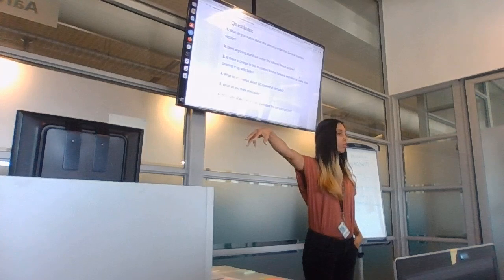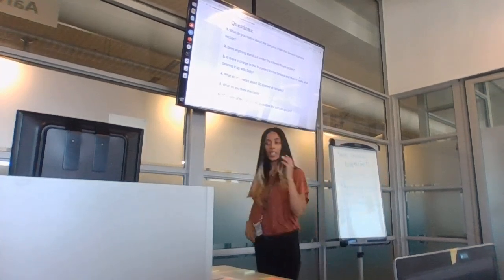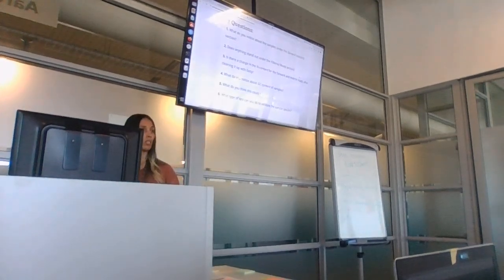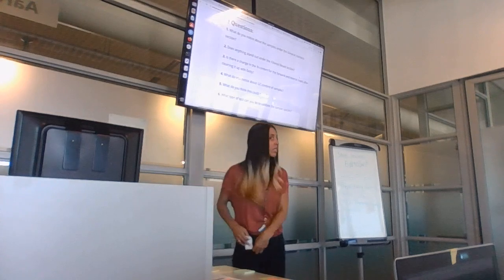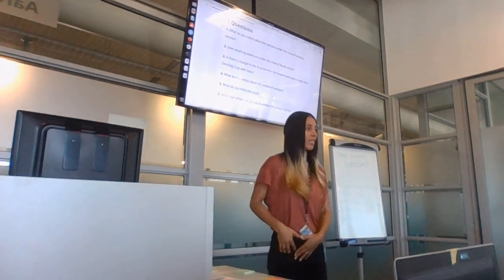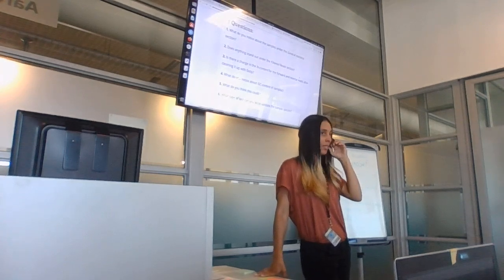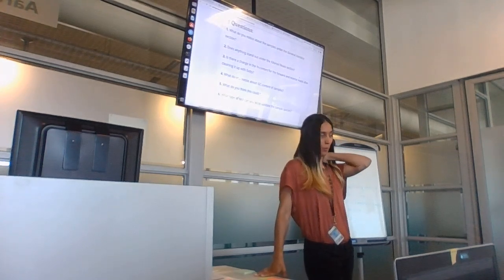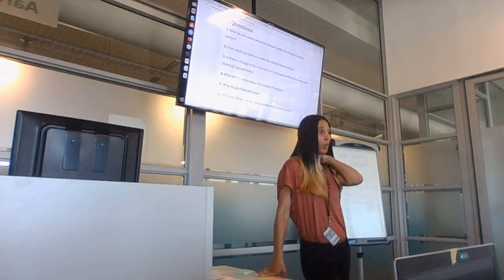What can you do? Has anybody done analysis past this to figure out what you can do, or how you should even think about the situation? So the first thing you said is this is likely contamination. But now, what type of contamination? How will I know what it is? It's not contamination, but maybe it's something else. But how do you find out what it is?